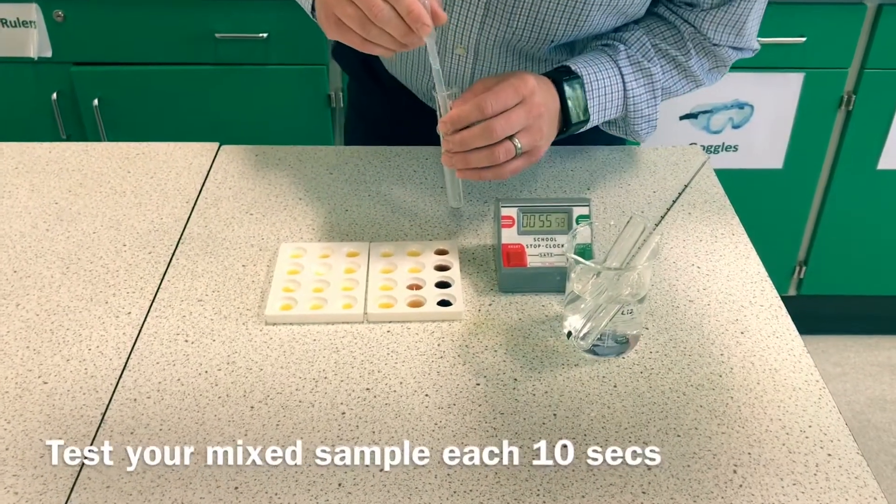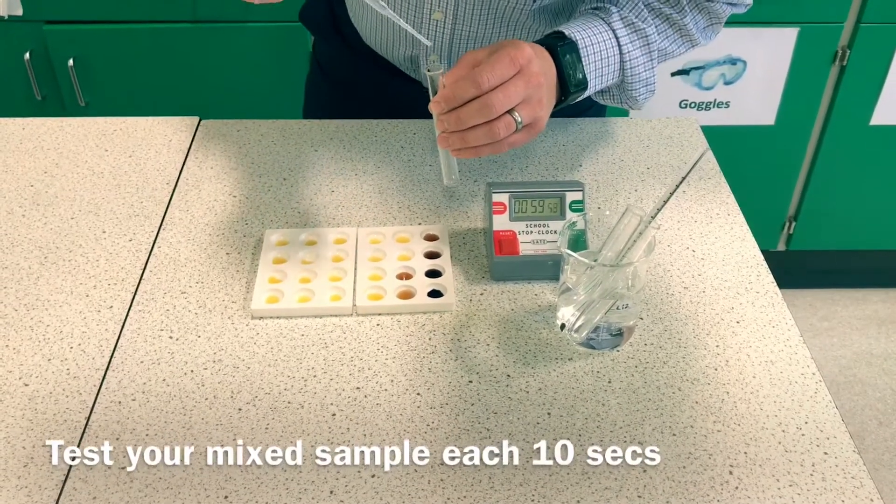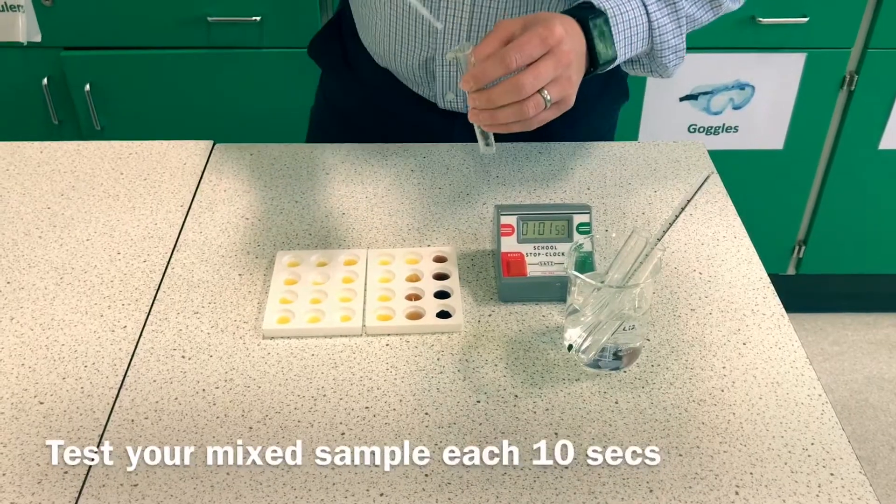Be careful not to use too much sample, or you'll end up with none left — especially when you're working with a pH that only digests the starch slowly.